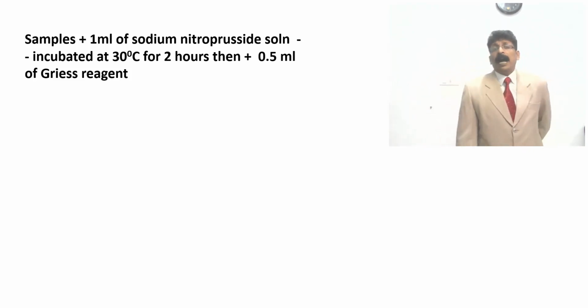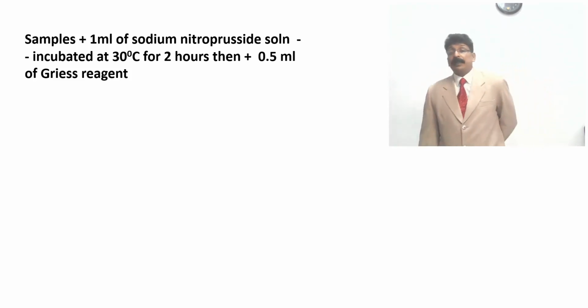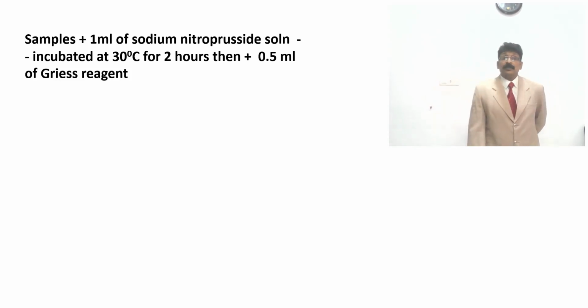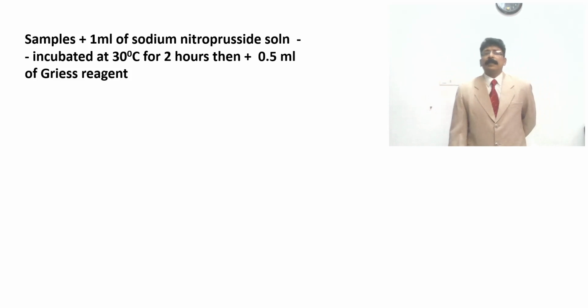After incubating for 2 hours, add 0.5 ml of Griess reagent. Then immediately you will get the color formation.